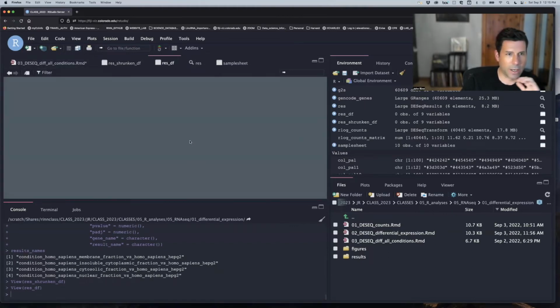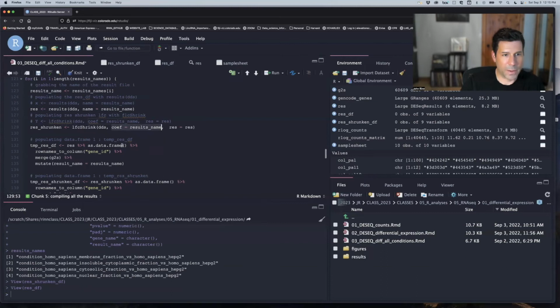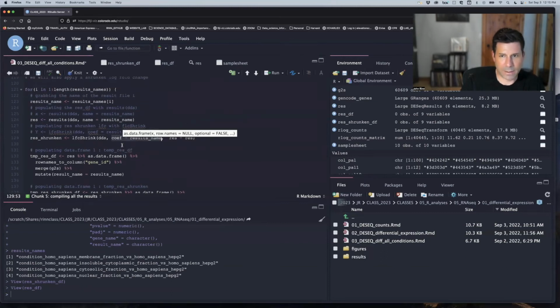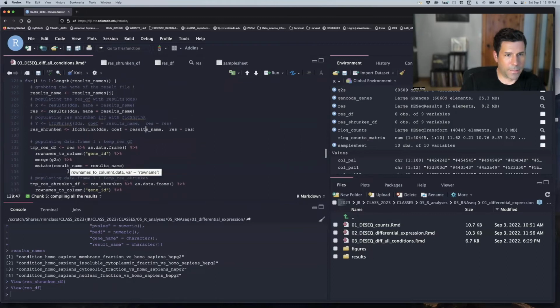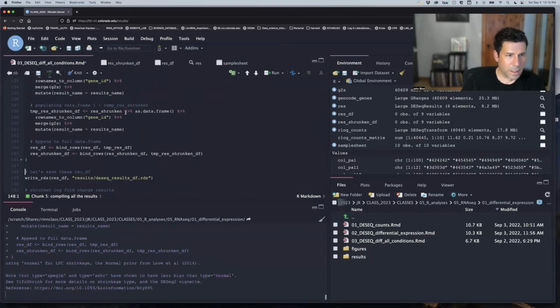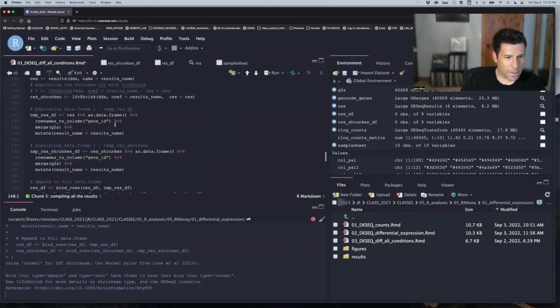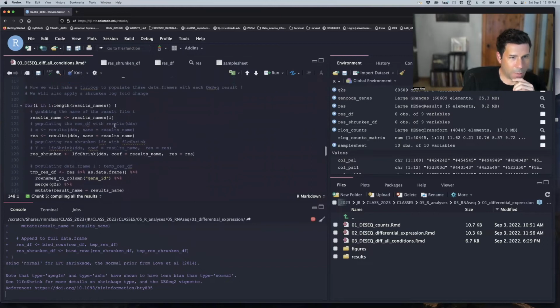that's the shrunken one, sorry. So where did, oh no, I must have started making that object. But we just looked at that sheet, and it's going to do that for the log fold change column in that sheet. Okay, and let's run that so we can get this moving. Oh no. So yeah, this is going to take a while because of this log fold shrunken change here.